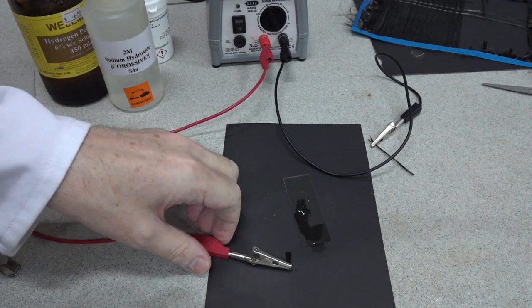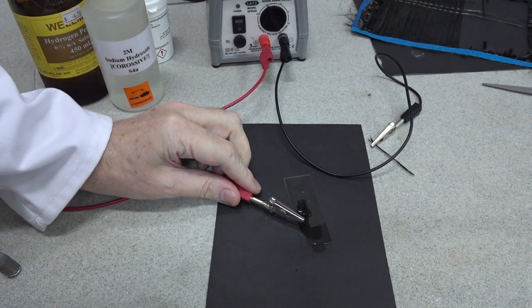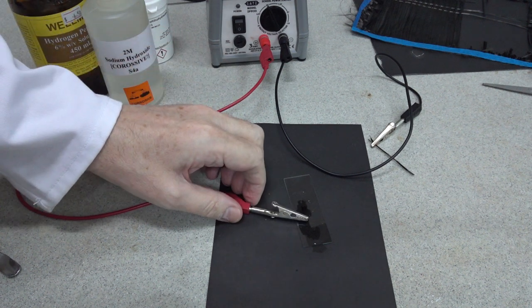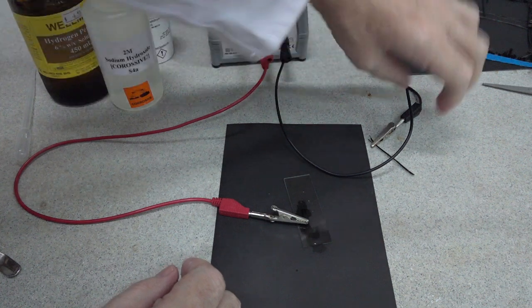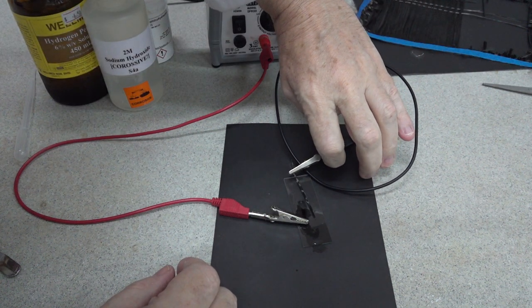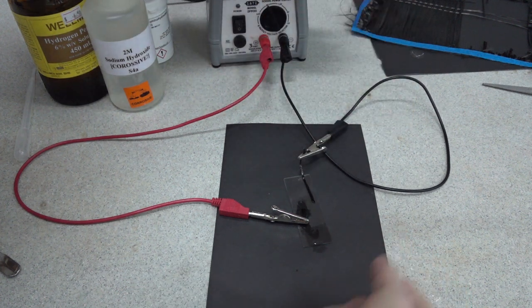Once we've done that, we then need to take the carbon fiber anode, which we'll place in the luminol there, and we'll also have a carbon fiber cathode which we'll place alongside it.